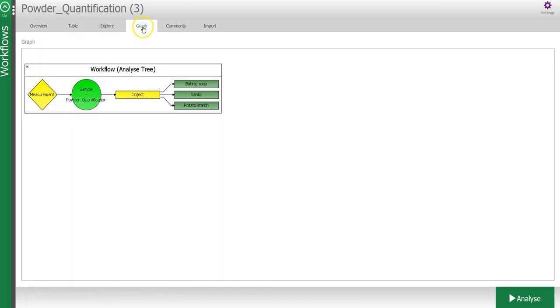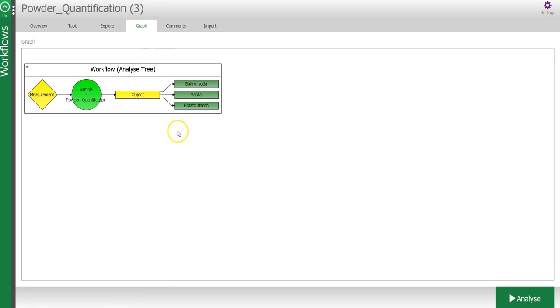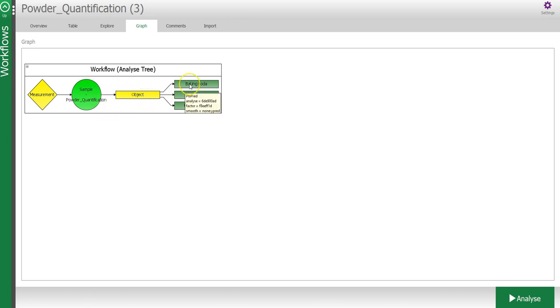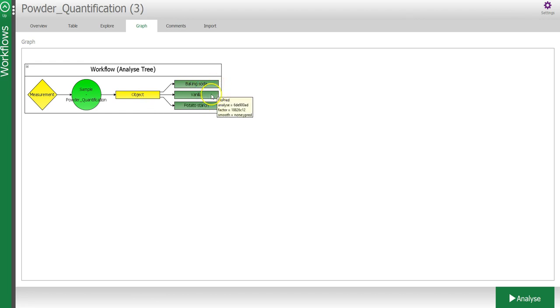In the graph tab, you can see the steps that are in the workflow. First, the measurement or image is analyzed by your sample model to find the sample object, for which it then applies your quantification model to calculate or predict the baking soda, vanilla, and potato starch content.